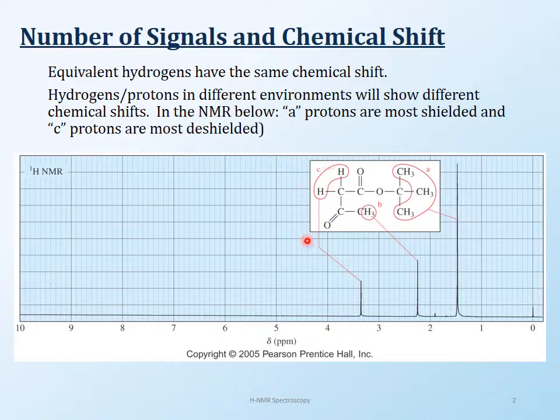So here is a compound, okay, and don't worry about the functional groups. The whole idea is to create different environments here. So here you have a t-butyl group where these three methyl groups are completely isolated from the other hydrogens, so they are in their own environment. All of these nine hydrogens are going to be the same because they're in the same environment. They're all attached to a carbon which is attached to an oxygen. So they will appear as one signal.